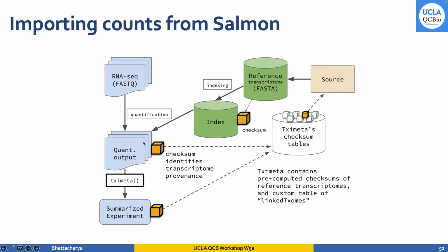Using this one command in R, the tximeta function in that package can take all of the data in these quant.sf files for all of our RNA sequencing quantifications, read it in and save it as a very tidy object in R called a SummarizedExperiment. That integrates neatly with differential expression software, packages for normalizing data, removing batch effects, visualization, network analysis, lots of different things you can do post quantification.